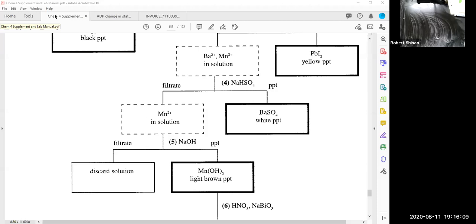Let me talk about this. Fortunately for me, I had gotten the lead out of solution, at least from what I can tell, practically all of it or all of it. And so then I can clean this up. Okay, not too much trouble.